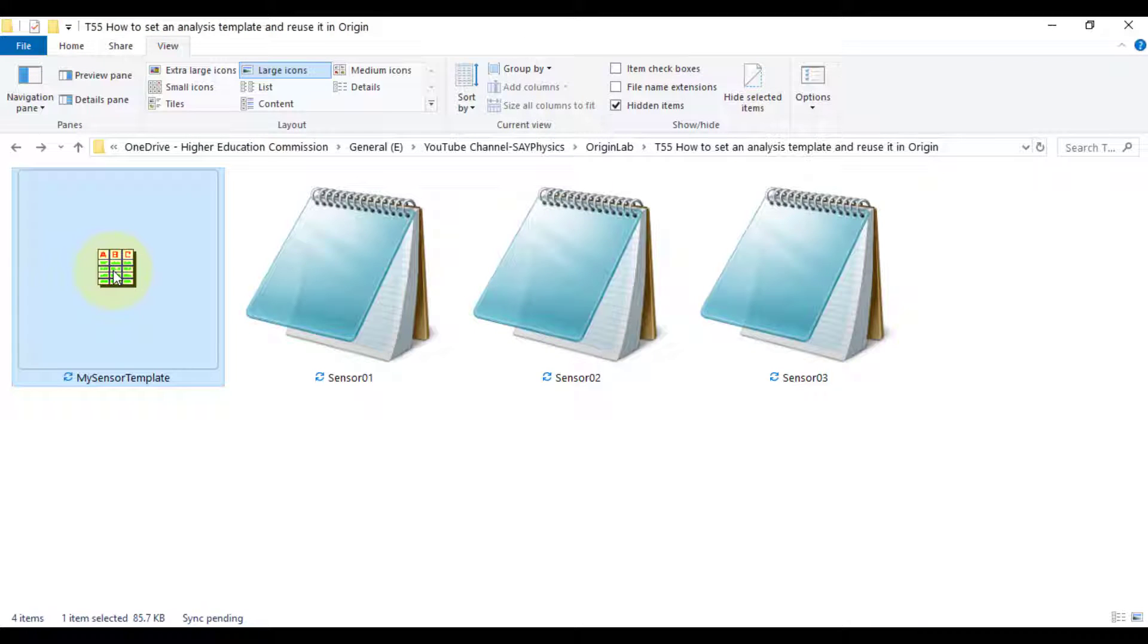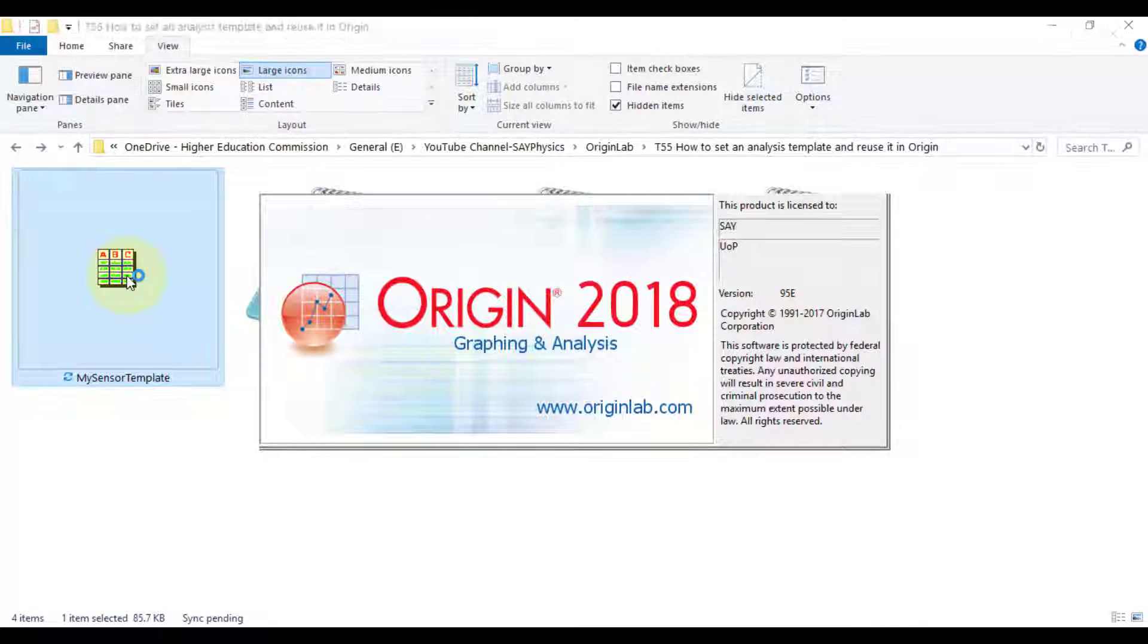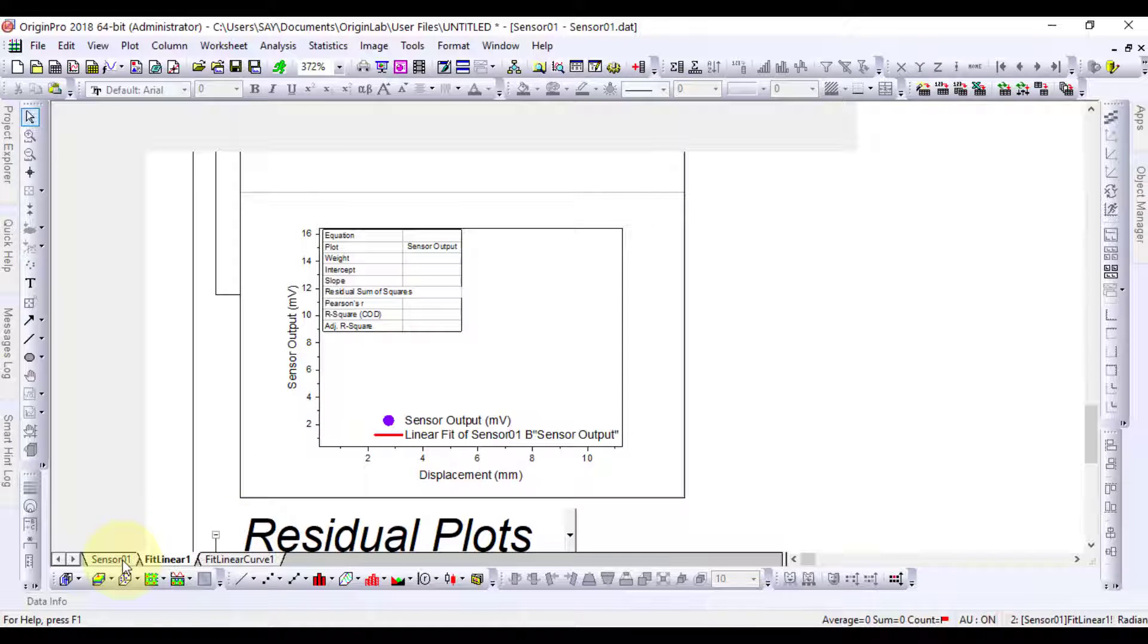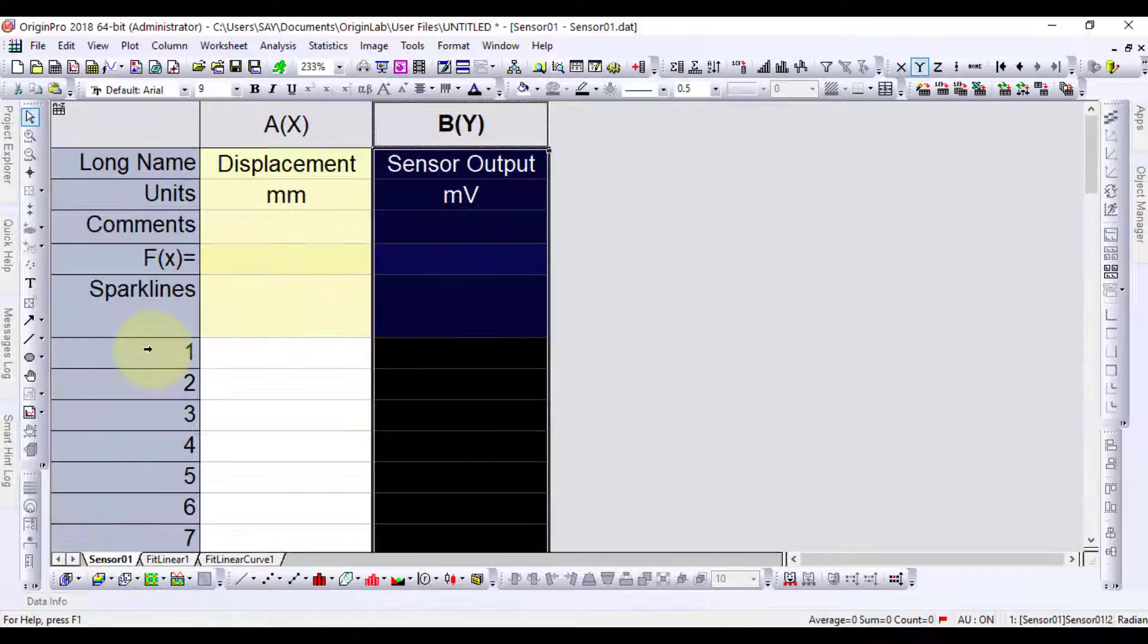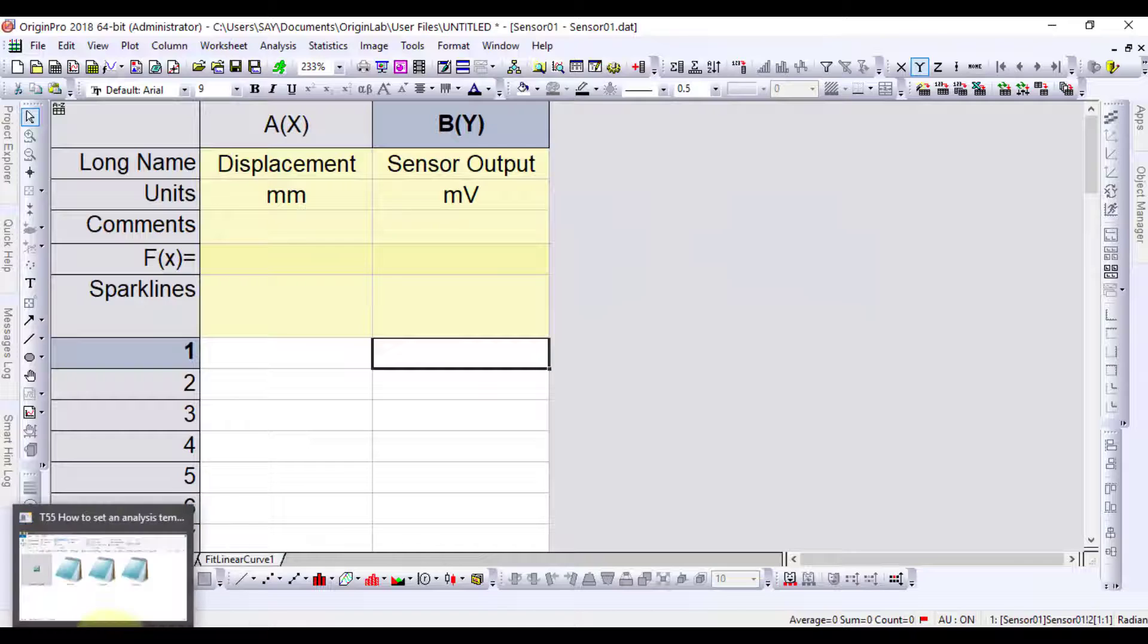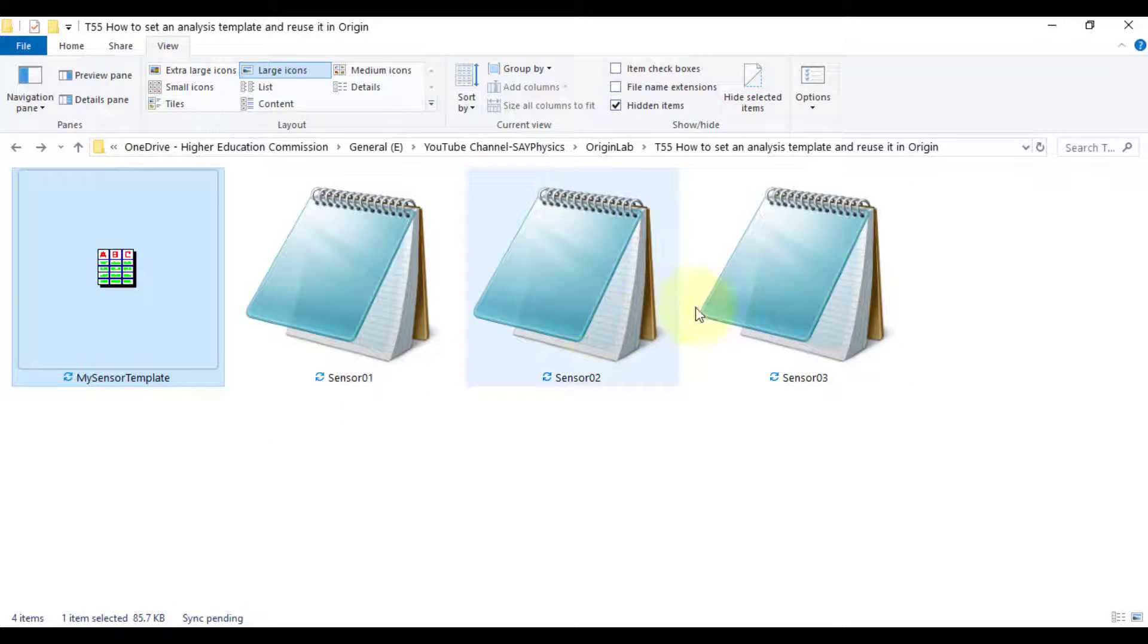In the same manner, let's import the sensor 3 data to have its calculation and plot.